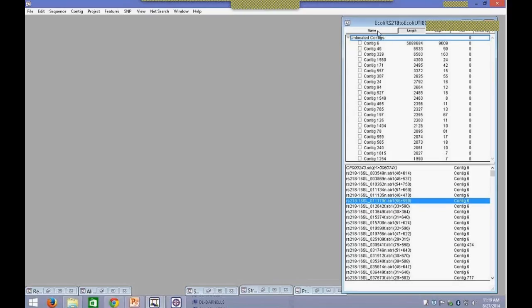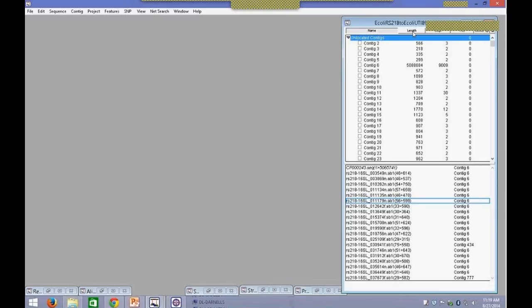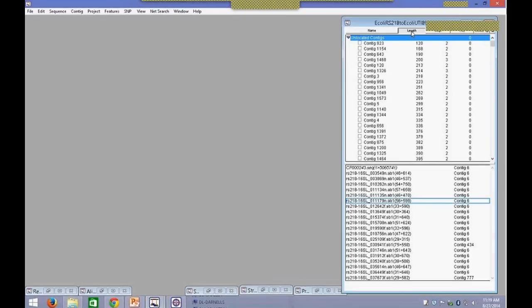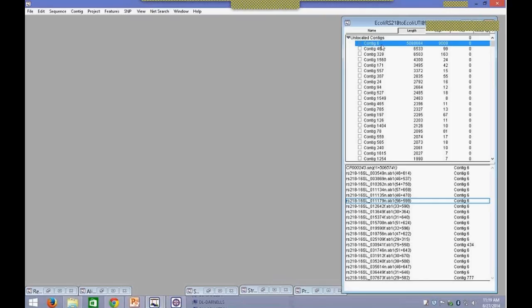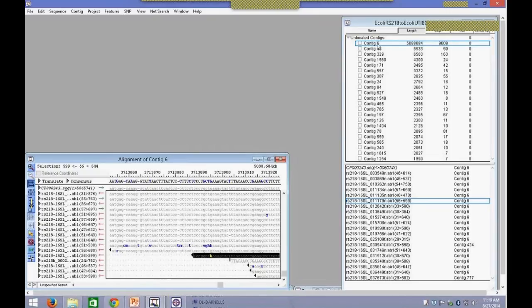We'll focus on the top part of this window, the contig view. Notice that we have different columns: name, length, and sequences. Each of these columns are sortable — you can sort by name, sort by length, or by sequences. I like sorting by length; this way the longest, biggest contig comes to the top. And now I want to double-click on this contig, and that will take us to the alignment view.